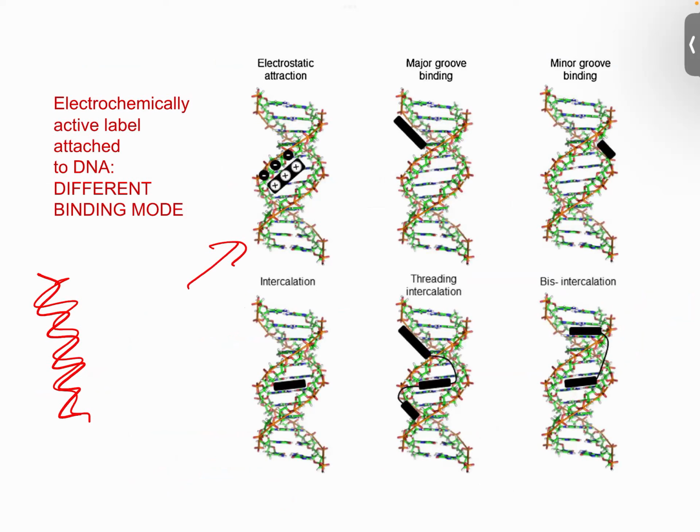So I mentioned before during the discussion, the principle of DNA biosensor is to tell us whether it is positive, you have E. coli in the system, for example, or no, you don't have E. coli in your drinking water. It is based on hybridization.